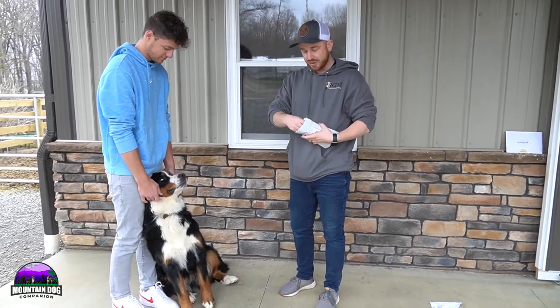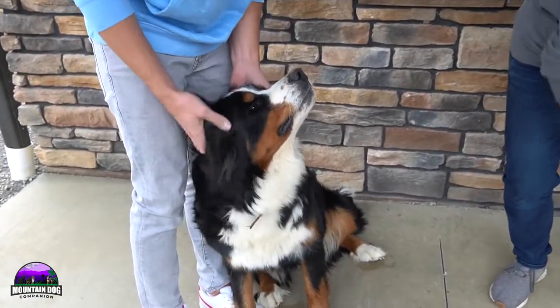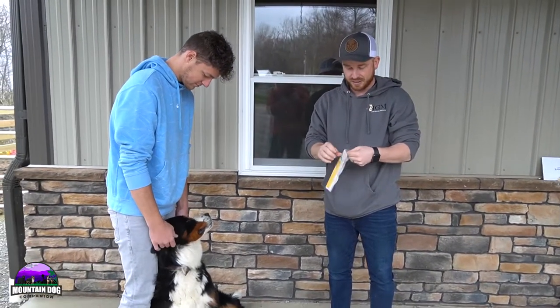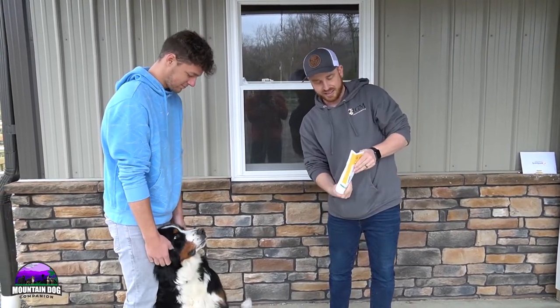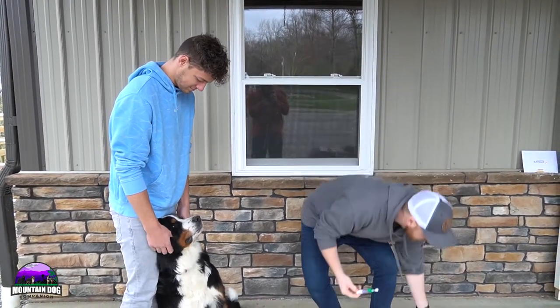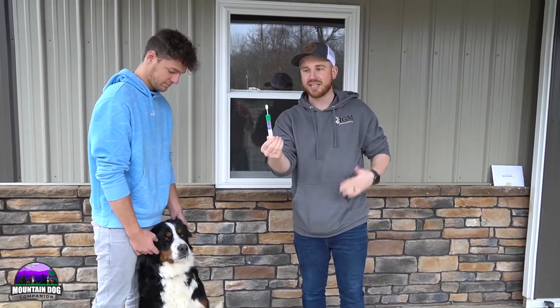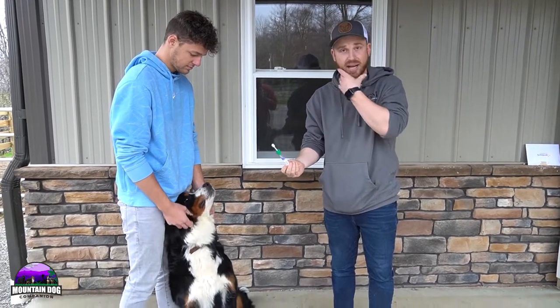Once we're done with this, we'll be able to send this out and make sure that we have everything we need to make sure that you are getting a healthy pup. This is a requirement for our website. And it comes in something like this. I just made sure nothing touched the swab — it's got to be clean, sterile. And I'm going to go ahead and put this in the back of Millie's mouth.